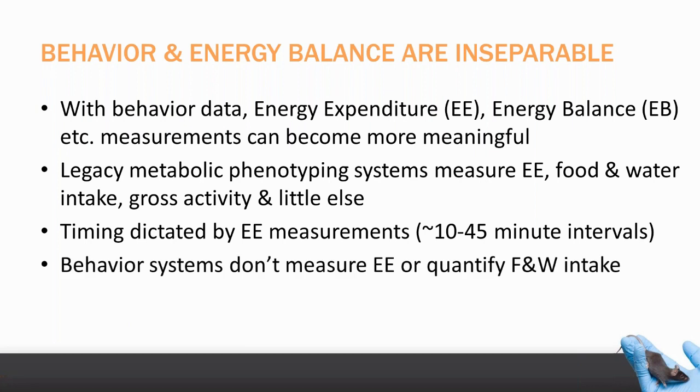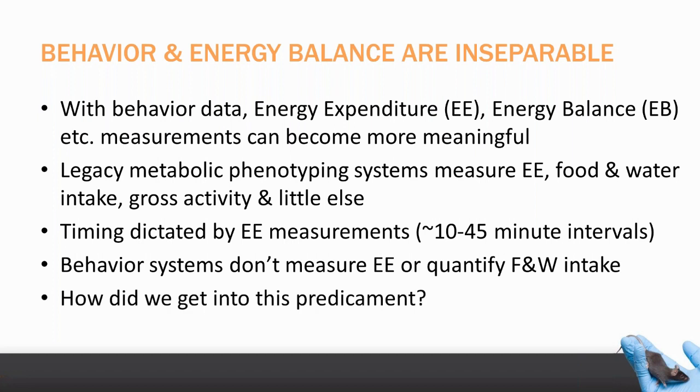And the other thing is, if you have a behavior system, it will be able to cope with the fast data stream from behavior, but on the other hand, generally speaking, they don't measure energy expenditure or actually quantify food and water intake.